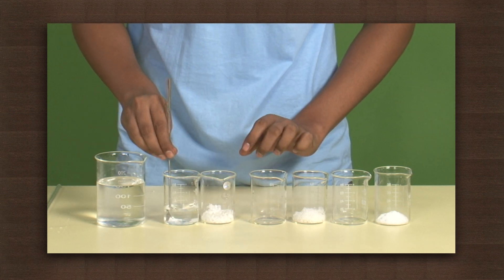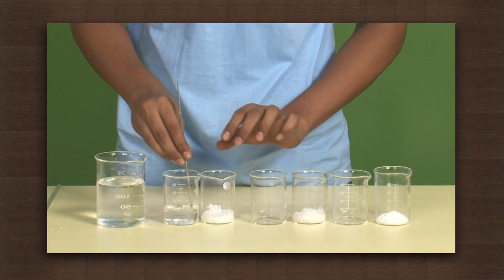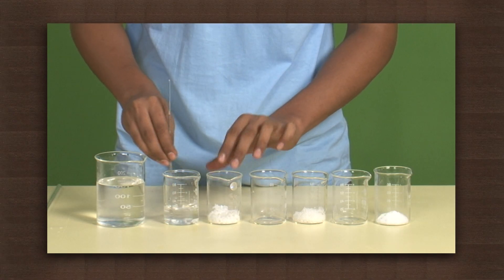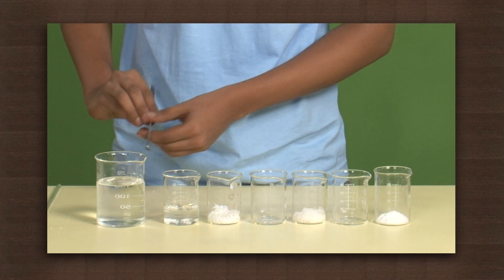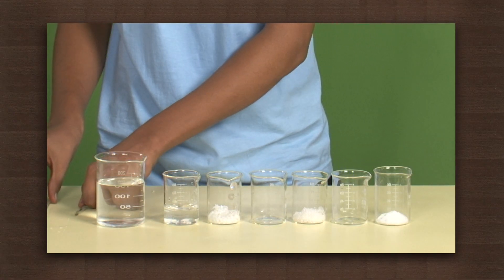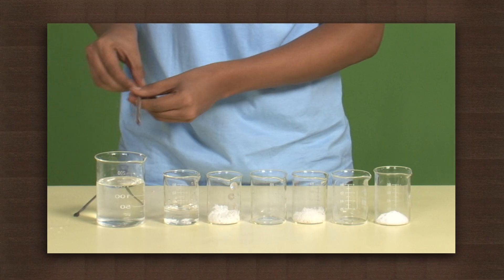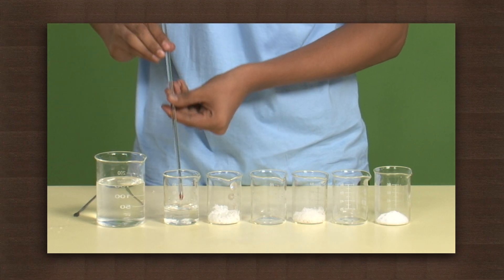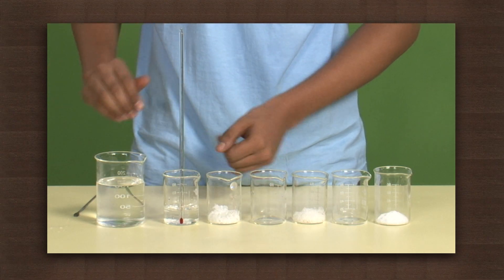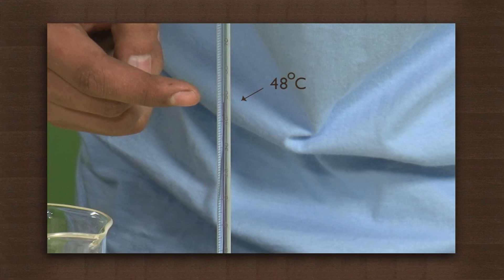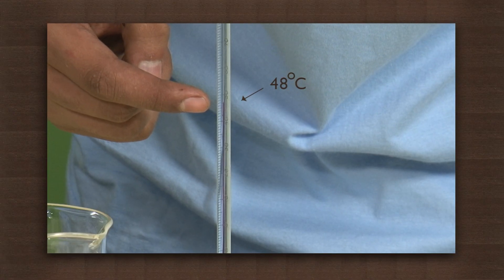and then add sodium hydroxide. Stir well. Note the temperature of the solution — the temperature is about 48 degrees.